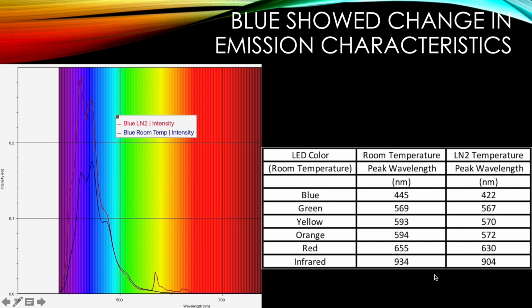And so the theory that the peak wavelength should shift to the blue because the band gap energy is effectively increased, because the electrons, because of their lower thermal energy, have a tougher time crossing, seems to be right. But also this involves how things appear to the eye and what the population is that's available to make that transition. So thanks Ocean Optics for helping solve this mystery.